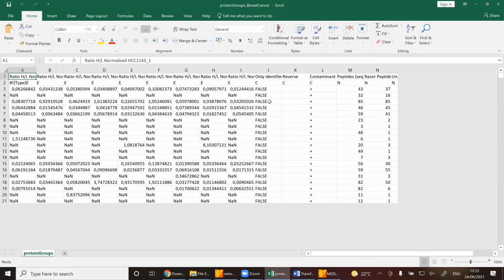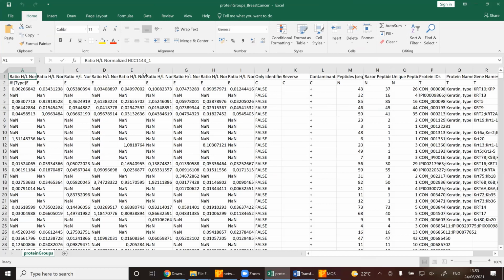It was from a SILAC experiment with different cancer cell lines. So what you get as an output in the protein groups table of MaxQuant will be ratio heavy to light labeled and normalized. And as you can see here, we have different cell lines. For every cell line, we have 3 replicates. And it's also important to keep in mind for later that this data set we're using today is a sub data set of a much larger data set. When you don't have SILAC data, but other types of data, let's say, for example, a label-free quantification, you won't have those ratio H/L normalized, but you will have the LFQ intensities, and this just works the same then.